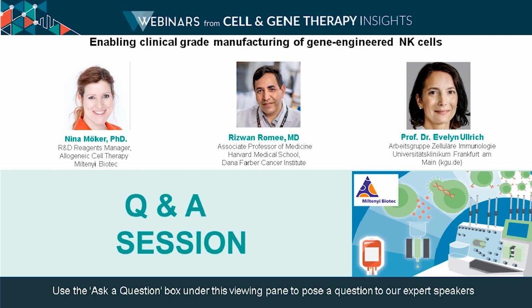At the time when we did the experiments, we could not find a good antibody against that target that was also suitable for flow cytometry. I very much prefer flow cytometry over Western blot, of course, and meanwhile we found a better one. If the person who asked the question is interested, feel free to email us and I can share which antibody we acquired.